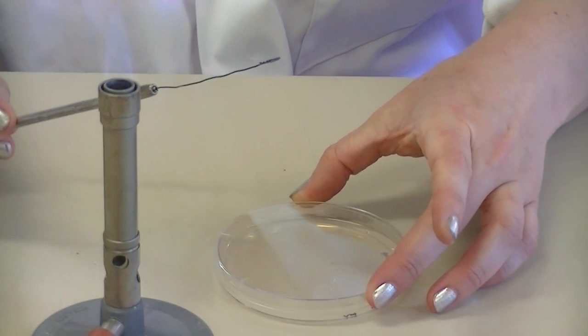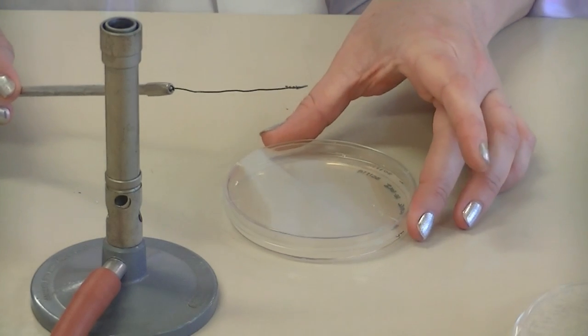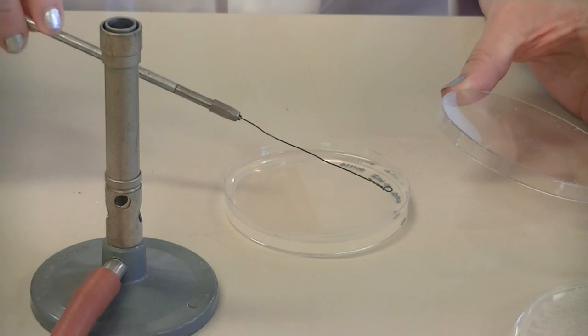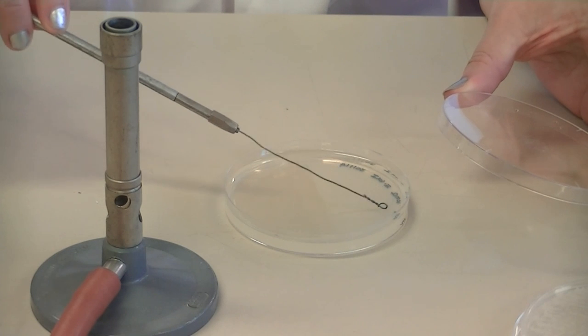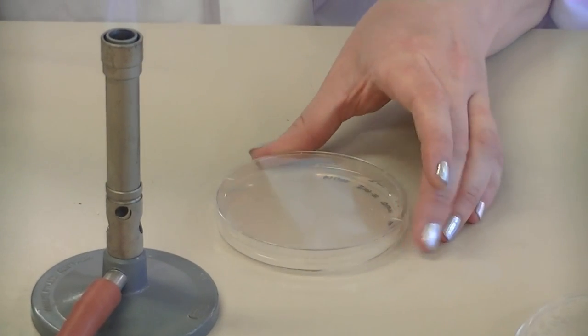You need to turn the plate so that you can perform your secondary set of streak lines — they must intersect with the primary ones. By turning the plate, that helps you to remember that you need to intersect them. Drag the loop across the surface of the agar, this time lifting it off at each of the strokes. Then replace the lid.